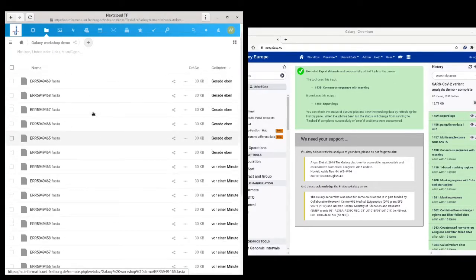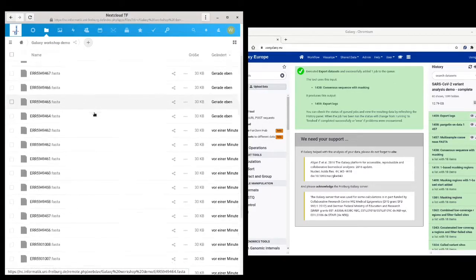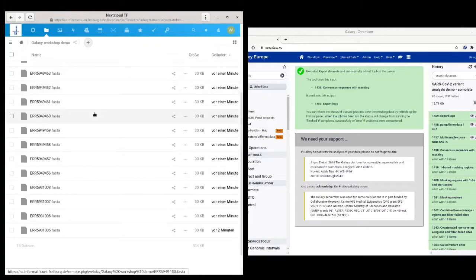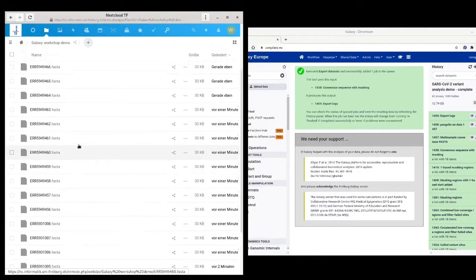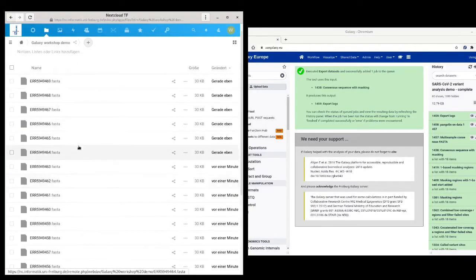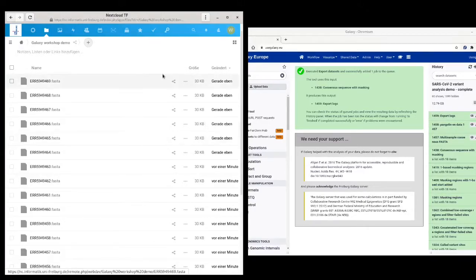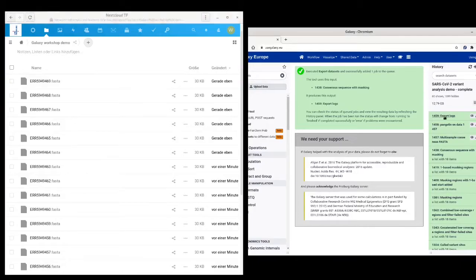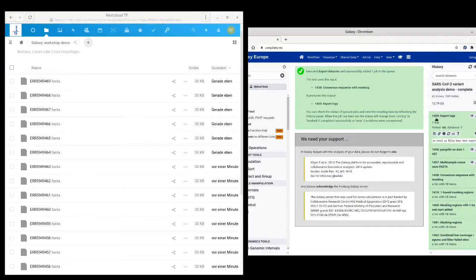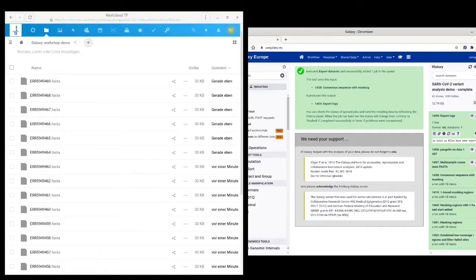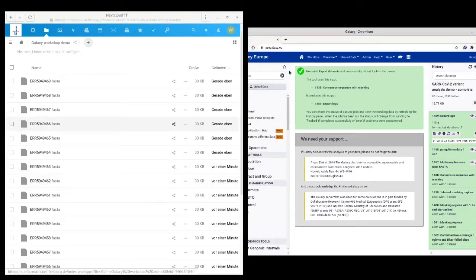And here we go, we have all 18 files ready on my folder now and the corresponding Galaxy job has turned to green and is marked as completed. I can also read in the logs that in total 18 files have been exported to my Nextcloud server.